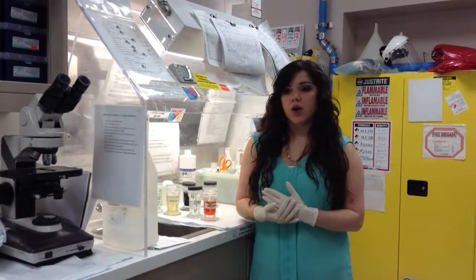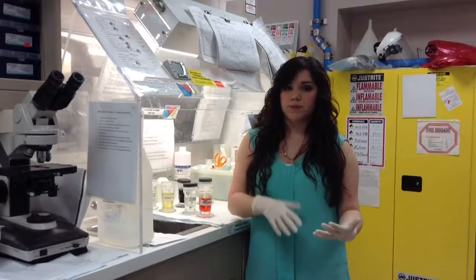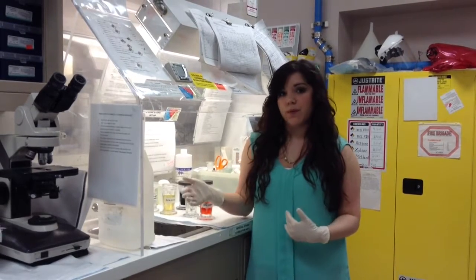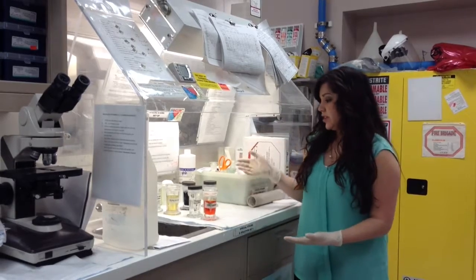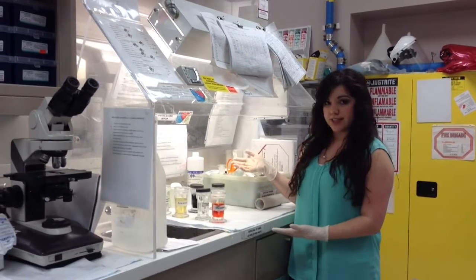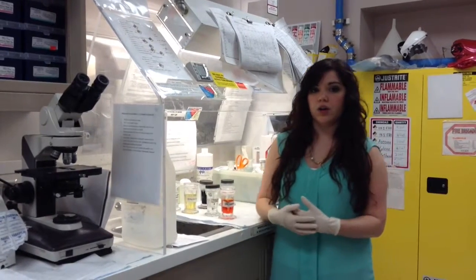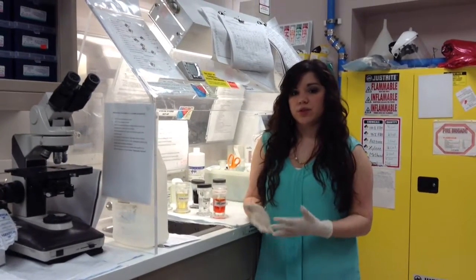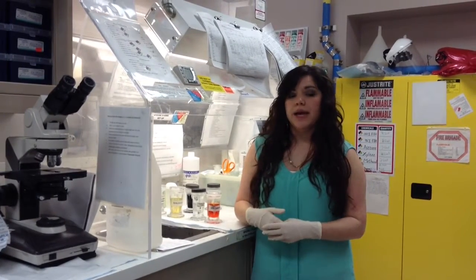First thing in the morning, what you'll want to do is go ahead and call the Special Stains Laboratory and set up an appropriate time for our student to go observe the Special Stains professional actually performing a GMS and iron stain. As a part of what you do during the day, you will be teaching them about our Special Stains setup and overviewing the role of the on-call cytotechnologist and some of the duties of the on-call cytotechnologist, which include the Special Stains setup in our lab.